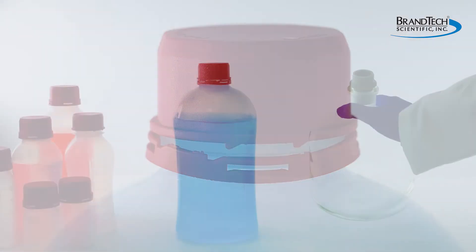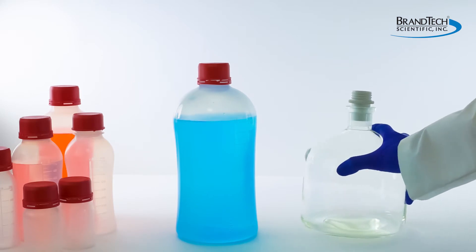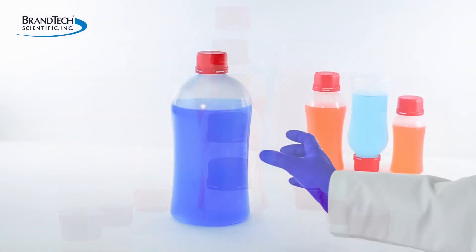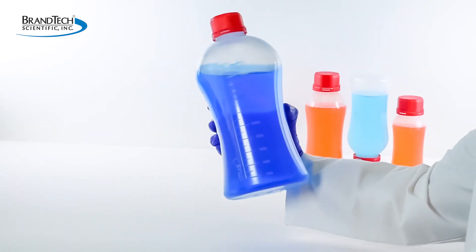Unlike regular bottles that are difficult to manage with one hand, the VitGrip bottle has tapered sides which provide comfortable single-handed grip. This is particularly useful with large volume bottles.